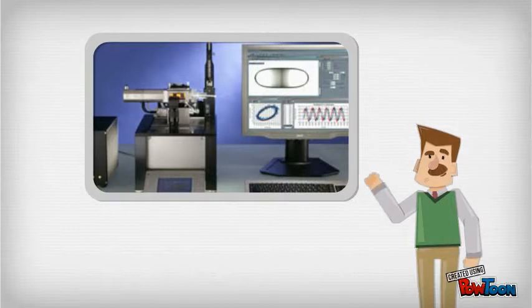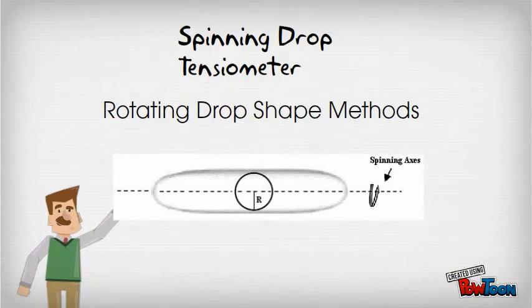The liquid drop will start to deform into an elongated shape. This elongation stops when the interfacial tension and the centrifugal force are balanced. The surface tension between the two liquids can then be derived from the shape of the drop at this equilibrium point.